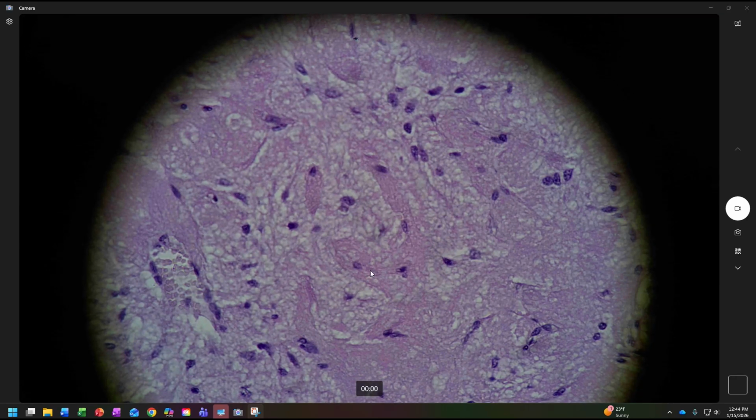Okay, so let's take another look at another slide. I'm going to see if I can find one that looks a little different but still shows the same thing. So I'm going to push pause and we'll come back in a moment. If you want to take a minute to think about this while I change slides, this would be a good place to go ahead and pause.